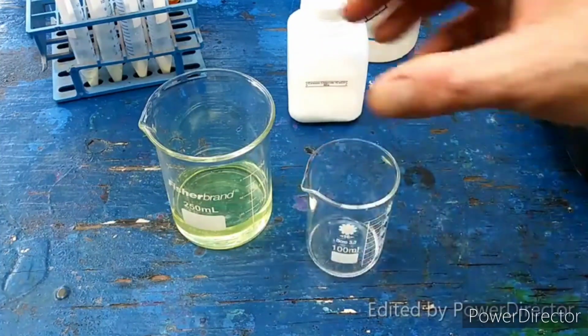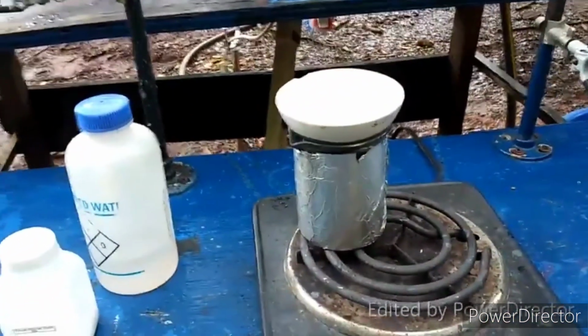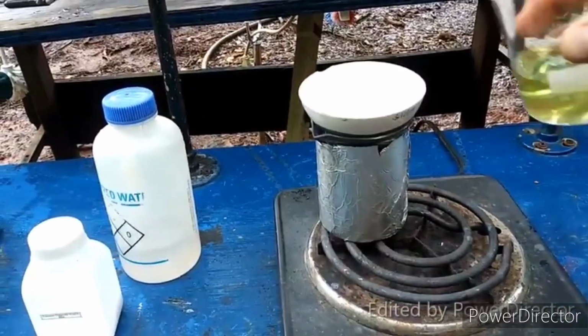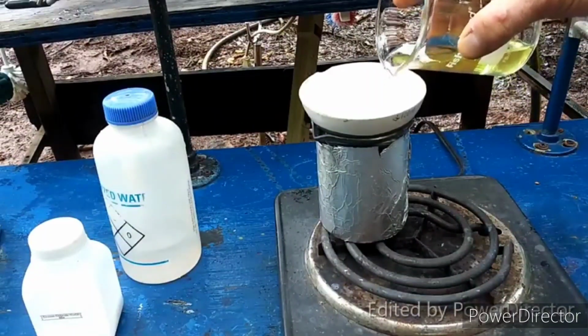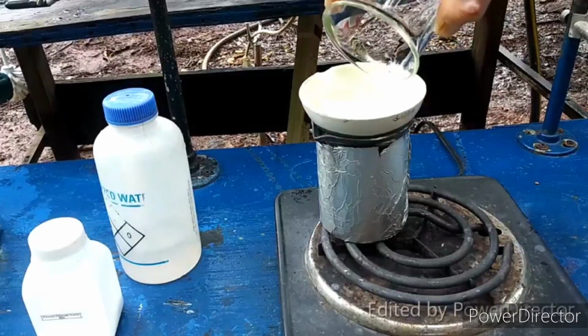Alright, now we are going to combine these two in the evaporating dish, and we are just going to let this evaporate down.